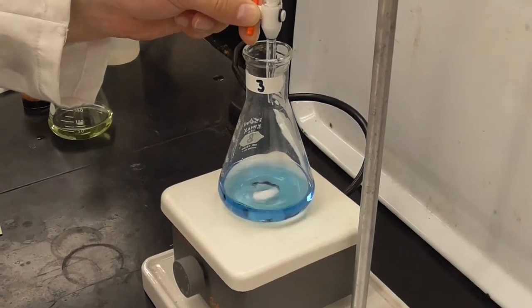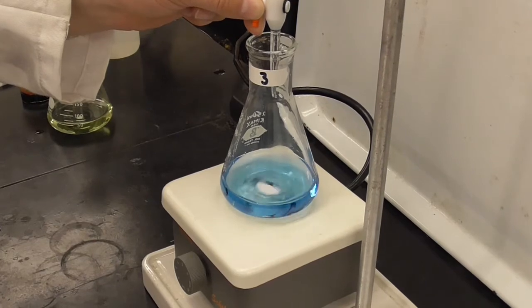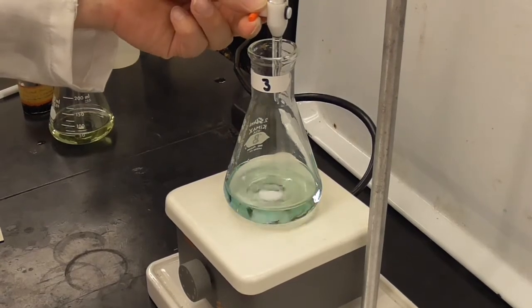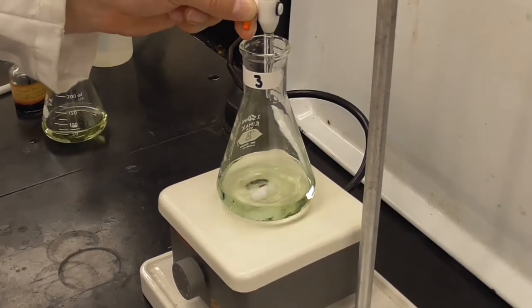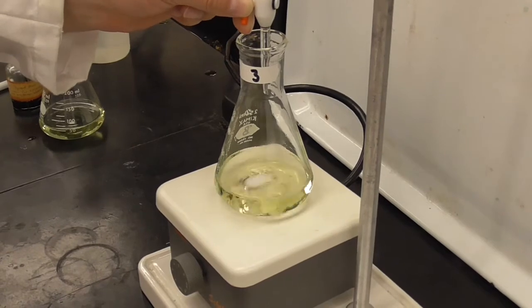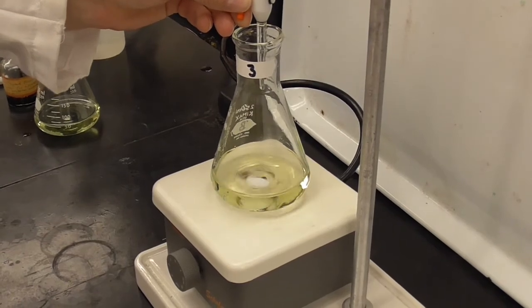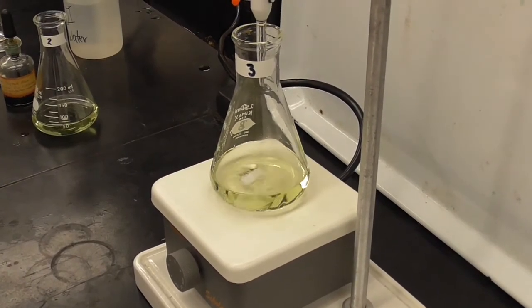Okay, so this is sample number 3, and we're getting close to the end point now. Maybe. We're getting there. Yeah, another drop at least. Another drop. Let's see what that does. Now let's go one more drop. One more. Okay. Alright, I think that's going to do it.